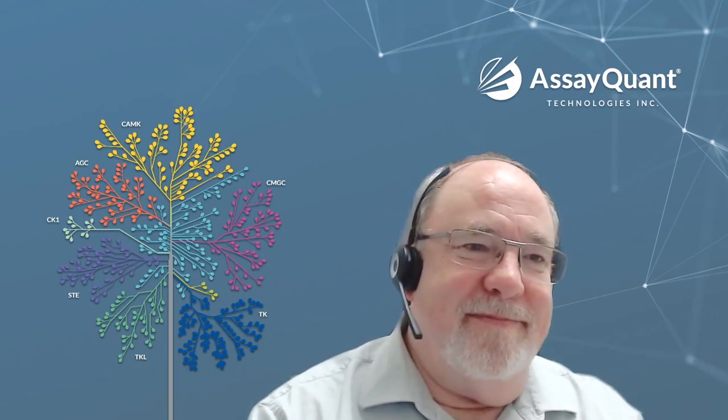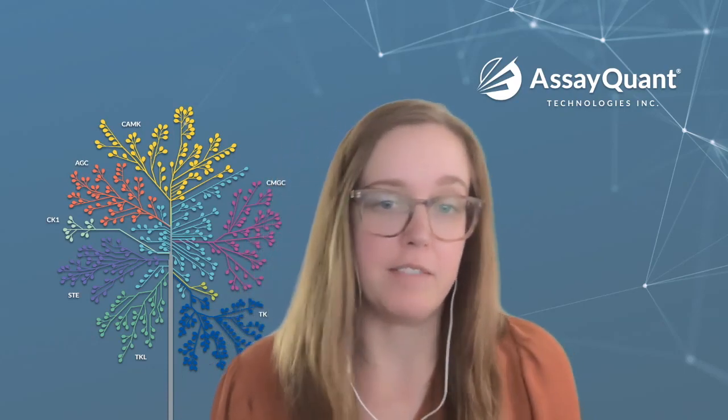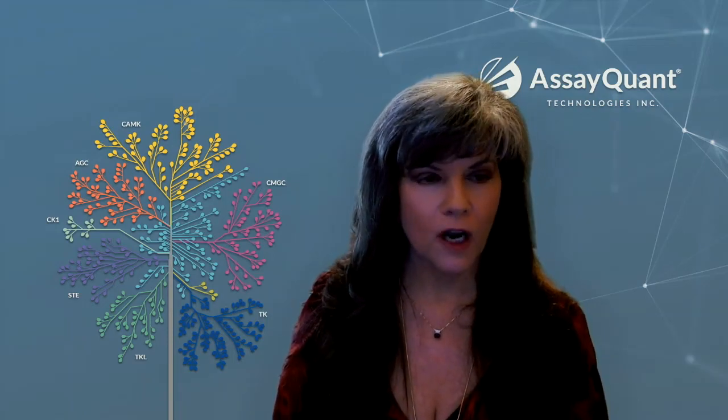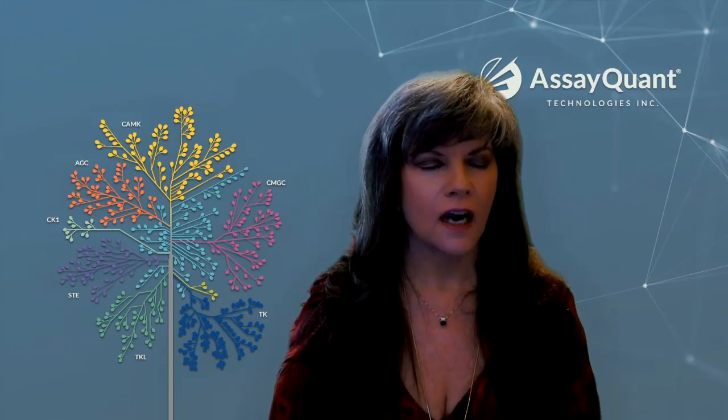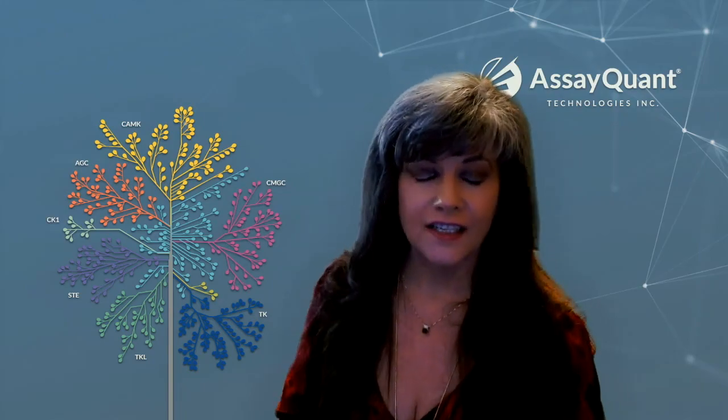Another one, I think, Michelle, you started to touch on this in your section, but do we only run these assays, or can they run them in-house? Can you kind of just describe a bit about how that works? Sure. So every application, including what we presented today, can be run in your lab, except for kinome profiling. And that is because you can imagine that we have 402 kinases in our panel.